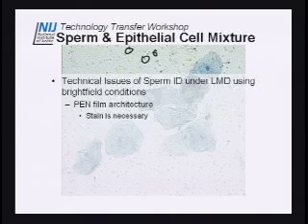So a stain is necessary. In some of the tests that I did earlier, I really did try to do it just unstained and cut out sperm from epithelial cells. I did have somewhat of an error rate, per se, where I would get a mixture, because apparently I wasn't able to see all the epithelial cell nuclei and avoid them. So I think a stain is necessary. It also helps to adjust the focal plane, like Kelly said.